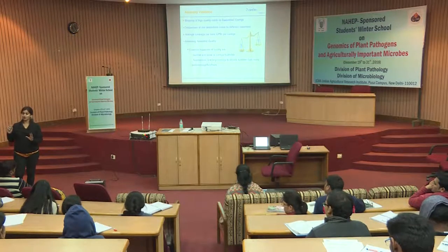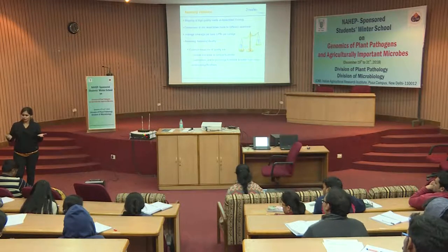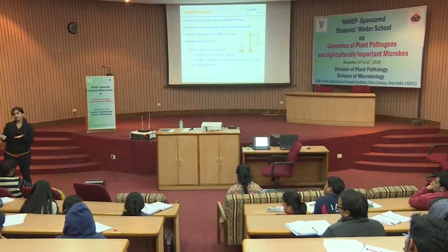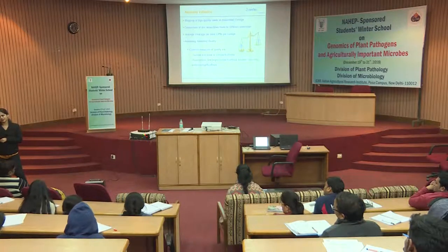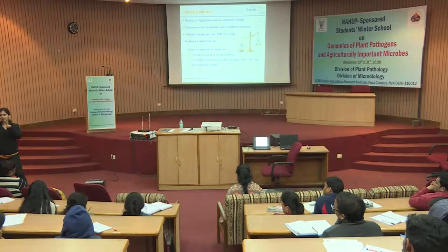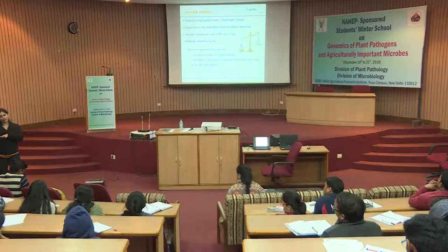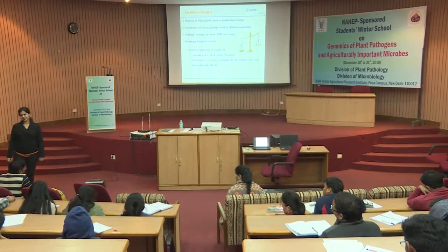If I am only doing PacBio sequencing, then I do not have anything to eliminate. I will eliminate based on quality and those things and then use it. So, I cannot differentiate whether the indels are from that particular platform or whether they were there in the sample, right. That is why hybrid approaches are good if you are going for complex organisms. Short reads can be used to eliminate those errors of indels, so I will filter them out in the beginning itself and then use those reads.